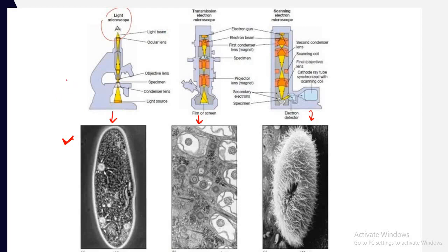Light microscopes have a limited resolution, only 200 nanometers, and that's the reason why the electron microscope was developed. Electron microscopes have a shorter wavelength, so their resolution is high, 0.1 nanometer. Because of that resolution power, only electron microscopes allow us to see the subcellular detailing structure, and subcellular compartments can also be observed, which you can see right here.